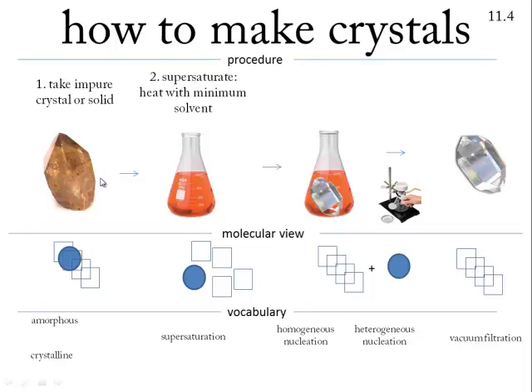So there it is, it's dissolved. Notice this stuff does not look very pure. So it's got a huge amount of solute, dissolved material in there, more than it can really handle.